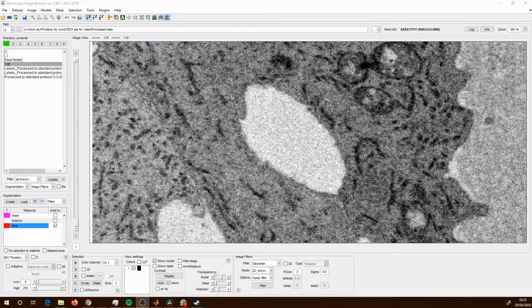Before you use the thresholding tool, you're going to have to assess which threshold you're going to use. So to do that, what you can do is look at the rough average intensity in the region you want to threshold. So in this case, if you look at this number here, represented by R, if this was a multi-channel image, then R would be the red channel in an RGB image.